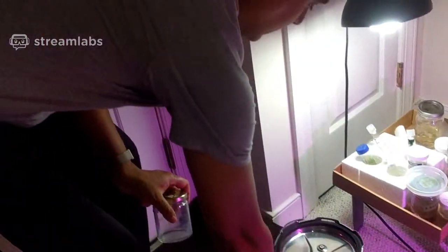One of the things I love doing is the following. Take an empty bottle like this. There are a couple of things that a person who grows things at home needs to have. A good pressure cooker. Some bottles.